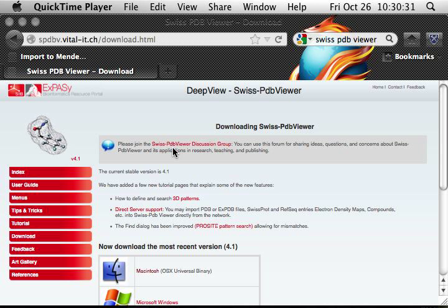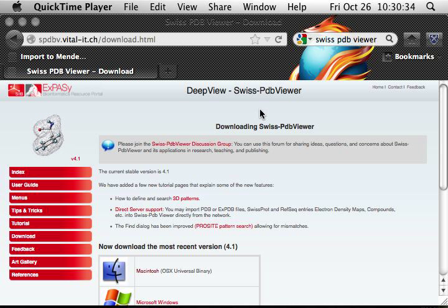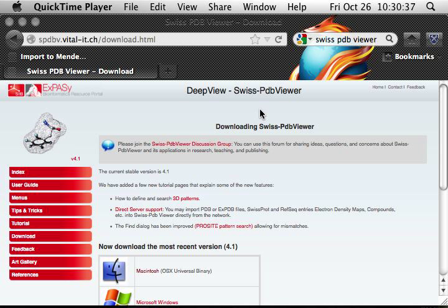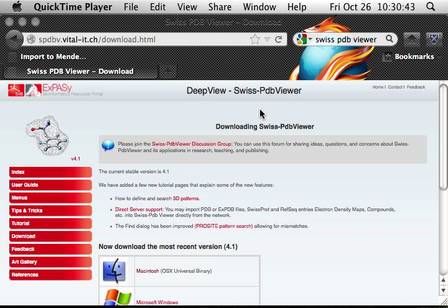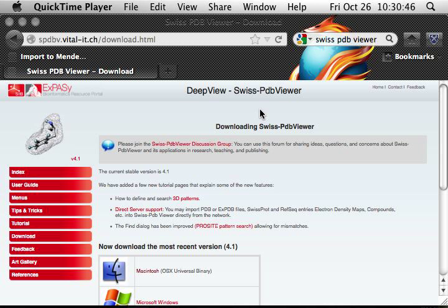This is a free software, Swiss PDB Viewer, so you can download it to your own computer and then do homework and assignment at your own pace.